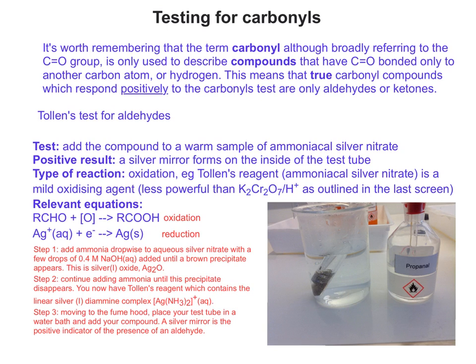And if we now add some propanal or an aldehyde to that mixture, you'll slowly start to see a silver mirror forming. It takes a couple of minutes, sometimes up to 5 minutes, so I've done this particular part of the clip in photographs instead so you can see the relevant parts.